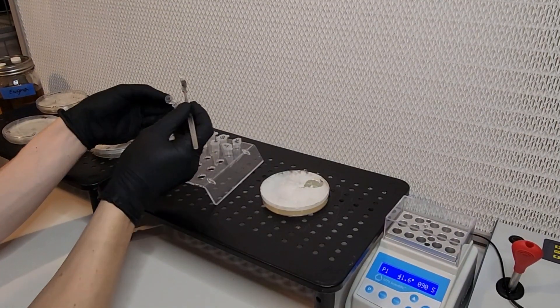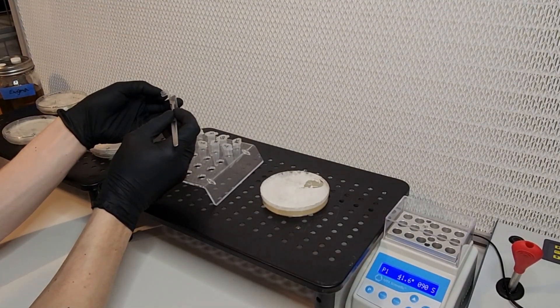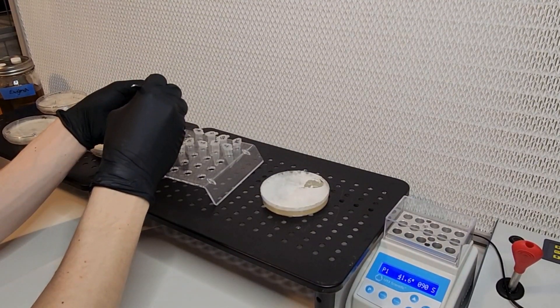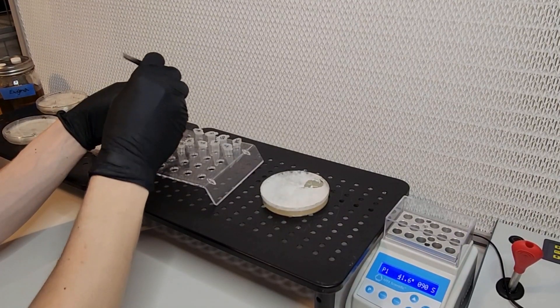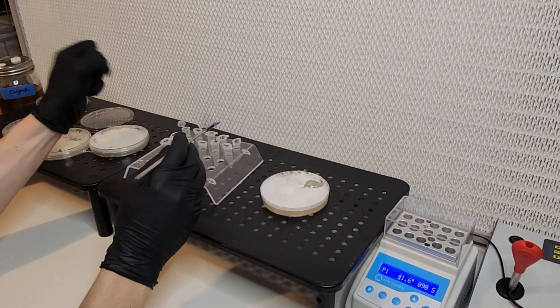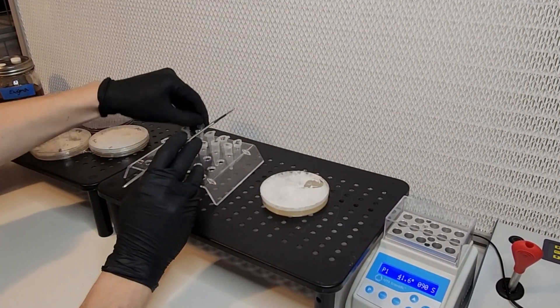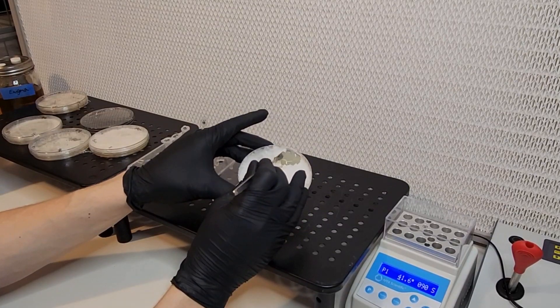Here you can see that I'm trying to get the mycelium into these little 1.5 milliliter microcentrifuge tubes without touching the outside of the tube. I want the blade of the scalpel to only touch the inside of each tube. That way it stays clean.